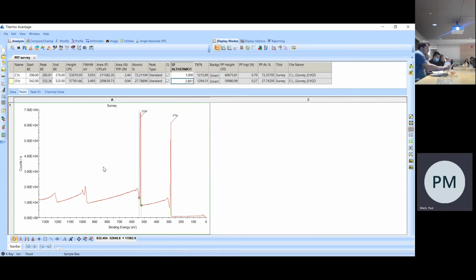Okay, so that's a fully manual process, and it can be good practice, I think, to do quite a few manual IDs and quantifications. It just kind of gives you an idea as to what's going on and how these things are derived.